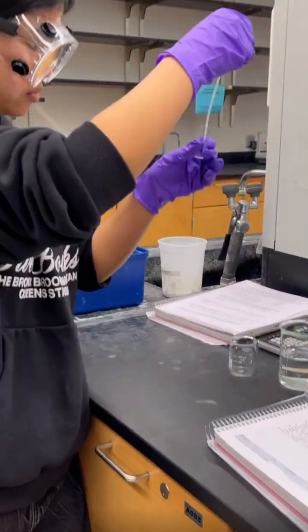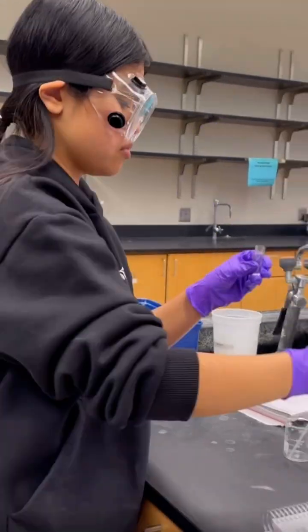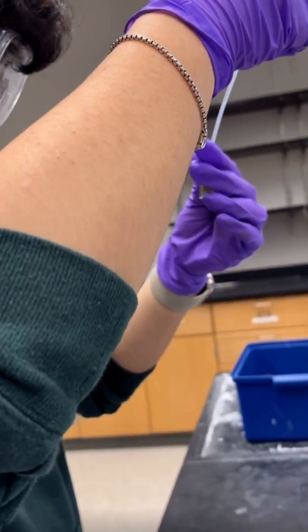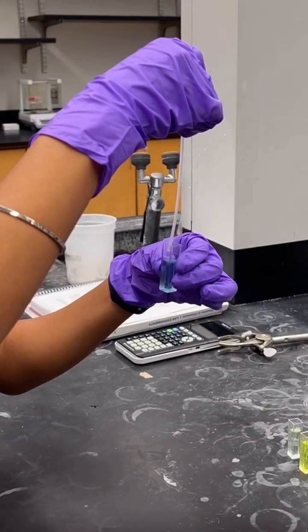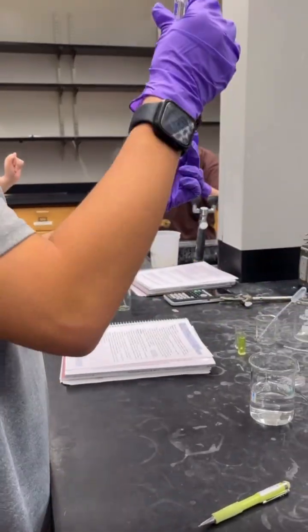We prepared our cuvettes for the spectrophotometer. We make sure the solution doesn't go past the 1.0 centimeter line on the side of the cuvette. We're reading the absorbance of the 3 different solutions: colorless, yellow dye, and blue dye. Another cuvette is filled with DI water to be used as a blank.